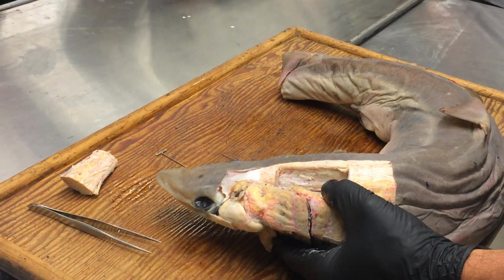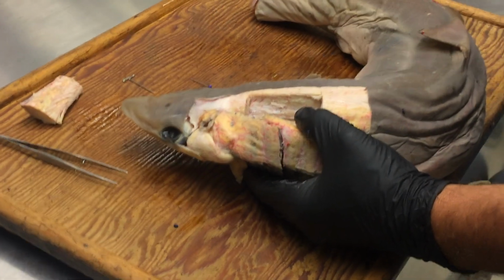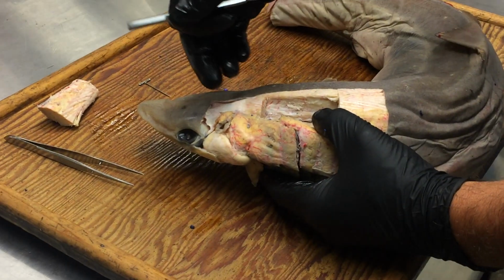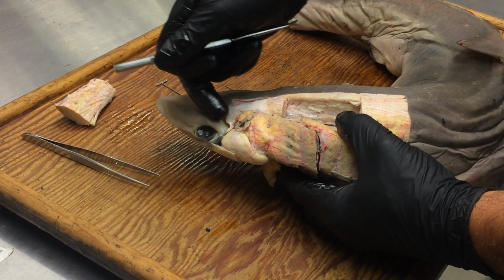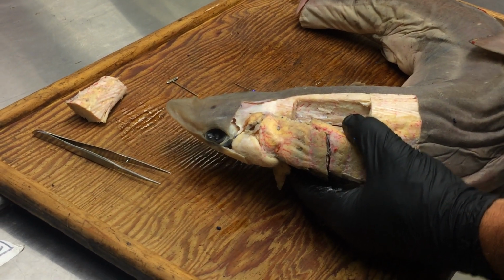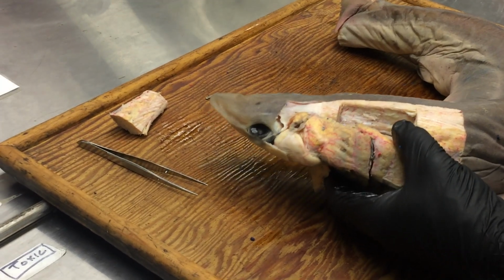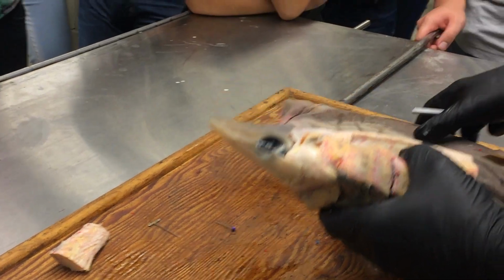There's one more mandibular arch muscle, and we won't see it on my chart because I haven't gotten in there yet, but you'll see it later today when you get into the orbit. And that's a muscle called the preorbitalis that runs back from the floor or along the floor of the orbit to the palatal quadrate, and it kind of pulls the jaws forward. And you know how sharks stick their jaws out when they go to attack. That's the muscle that's involved in doing that. All right, so those are the mandibular arch muscles.